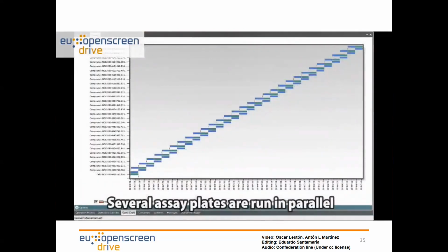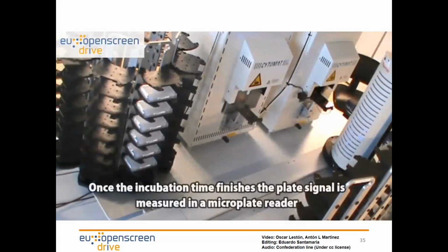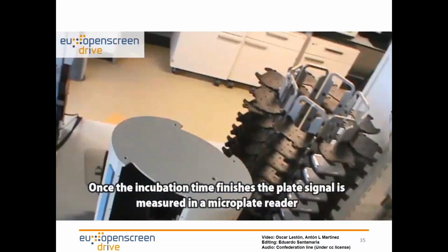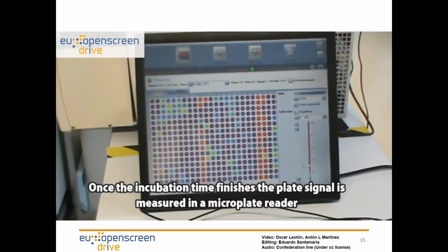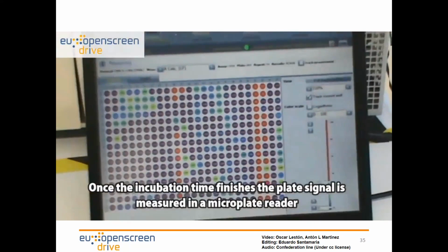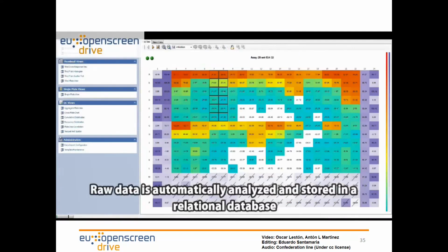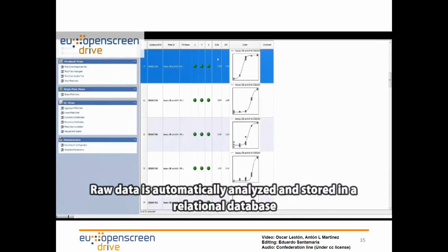As everything is fully automated, several assay plates are running in parallel. Each of these blue bars belongs to a given plate. The system schedules them in time in order to avoid any plate incubating for a longer time than any other. Once the incubation time is finished, the robotic arm introduces the plate into the reader. The reader reads the barcode and the readout is carried out, and all the data obtained is stored in a file format that can be easily integrated into the databases, as Francisca showed, and from there you can easily obtain and review those response curves, validate the compounds, etc.